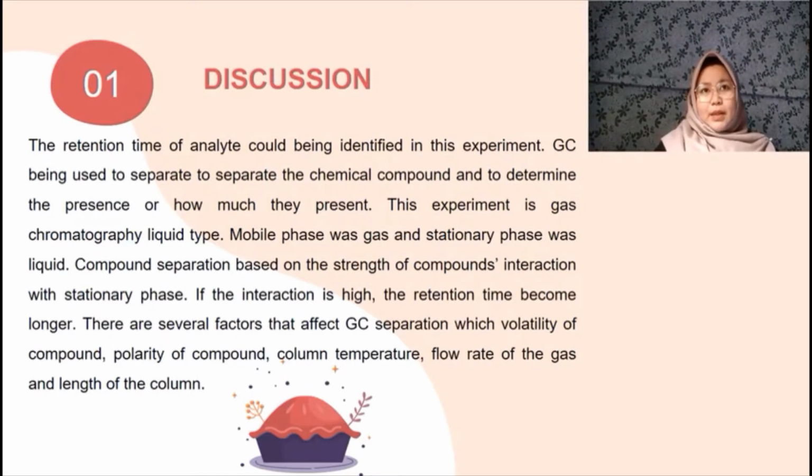As the sample was injected into the injector, it passed through the column, then the analyte could be detected by a detector. Based on the results obtained, the retention times of the analyte in mango juice, orange juice, kaki juice and carrot juice were 2.30, 2.18, 2.46 and 4.18. Through this, we can see that the retention time of the analyte in carrot juice was the highest value.